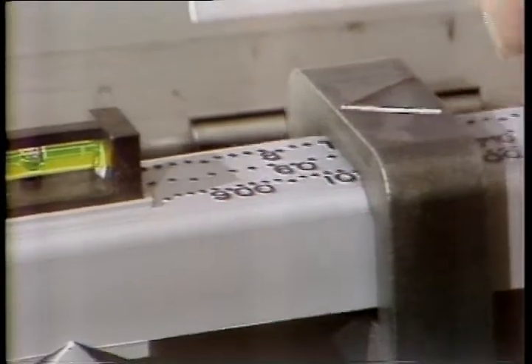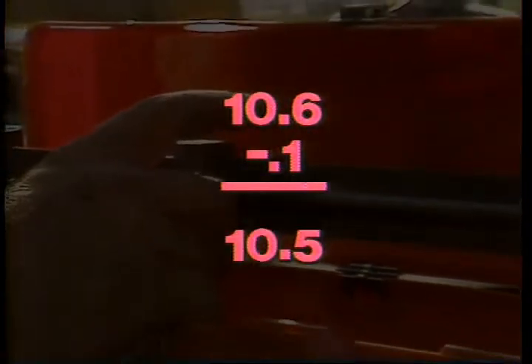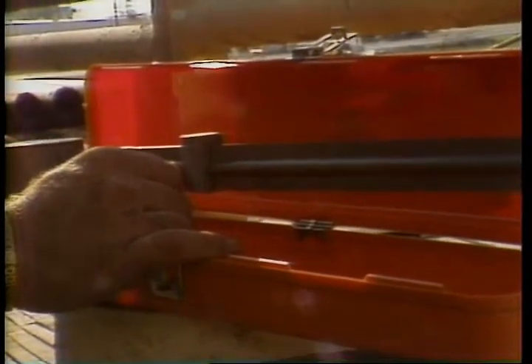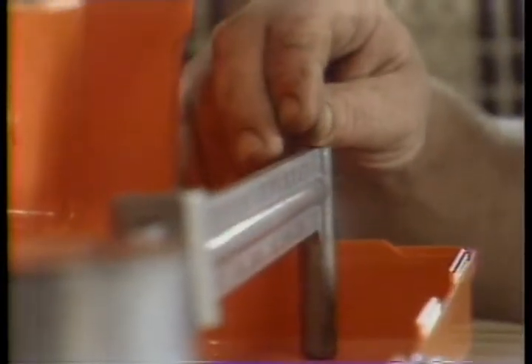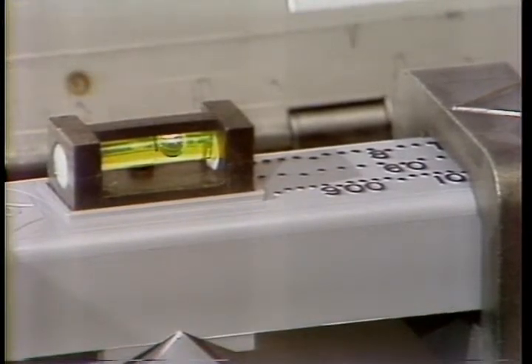If it's not exactly right, you can make mathematical adjustments pretty easily. For example, if the reading is heavy by 0.1 ppg, subtract 0.1 from the reading of your mud density. Better yet, fix the scale. This is done differently on the different scales, but on this IMCO, it's done by adding and subtracting these little rubber O-rings from the end of the balance. On the Baroid, it's done by adding or subtracting shot at the end. Once you've got this done, you'll know your readings will always be right unless you don't weigh it right.